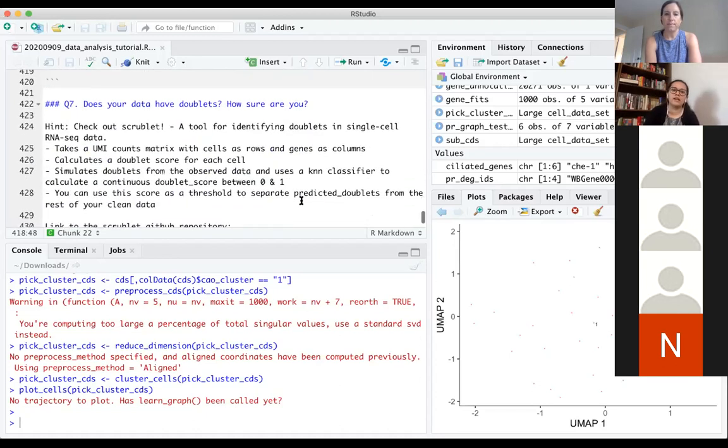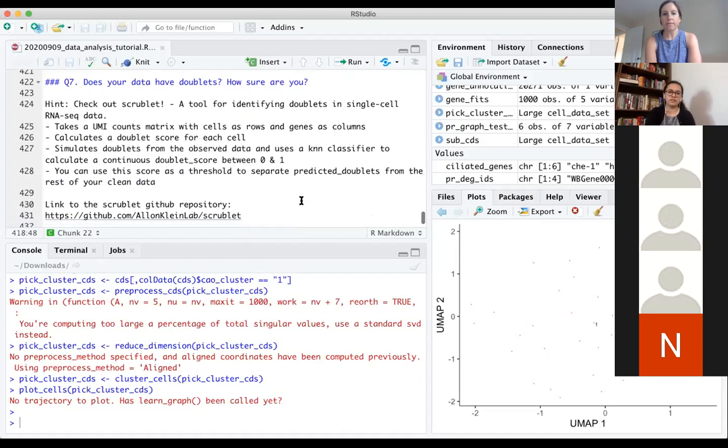All right. And the next part is, we're not going to do anything, but this is a very, very important part when you're working with single cell data analysis. You want to absolutely ensure that you're working with good data and you don't have any doublets in your data. At the BBI, we use Scrublet in our pipeline to call all the predicted doublets.